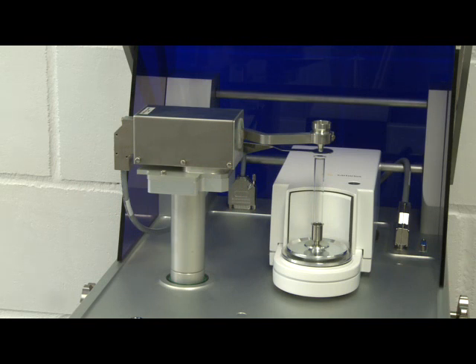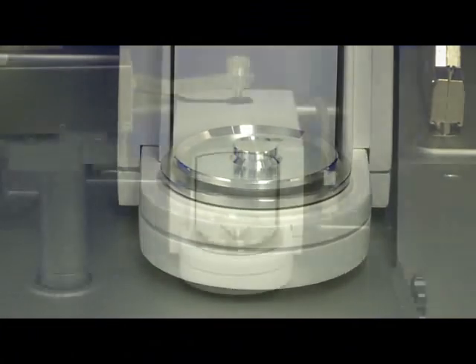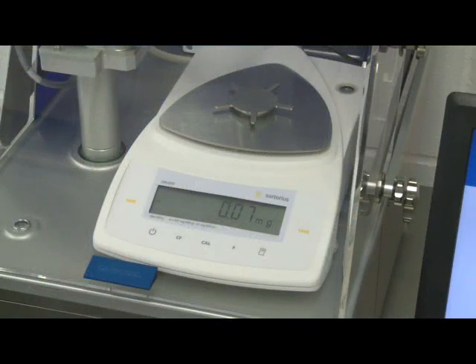The Accelerlab dispenser uses specially adapted Sartorius balances. Options are the SE2 or ME10 microbalances, which can weigh a maximum of 2g or 10g respectively. These balances have a 7 decimal place display, so are ideal for dispensing very low weights accurately. The CPA225D balance can weigh a maximum of 220g and has a 5 decimal place display, making it ideal for general laboratory tasks. The Accelerlab dispenser can be set up with any of these balances and they are easily interchangeable.